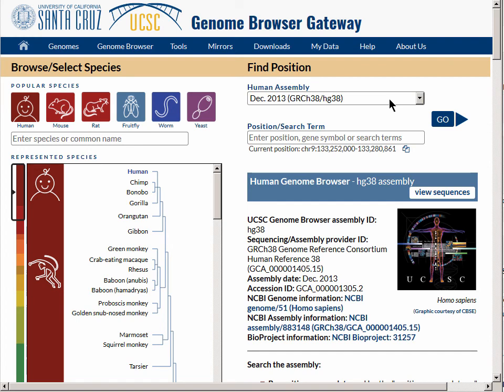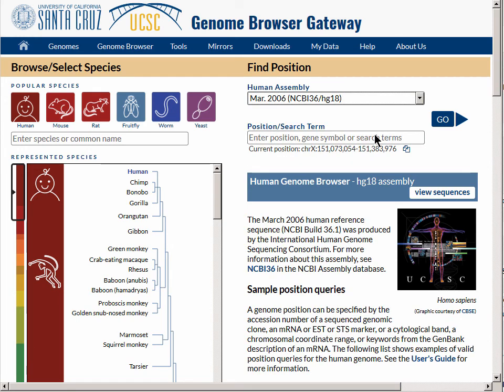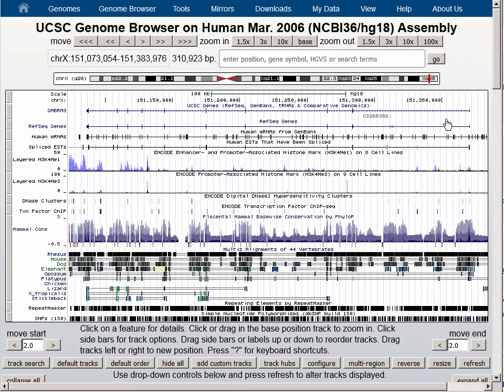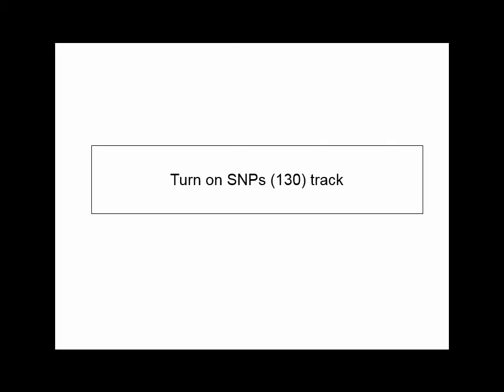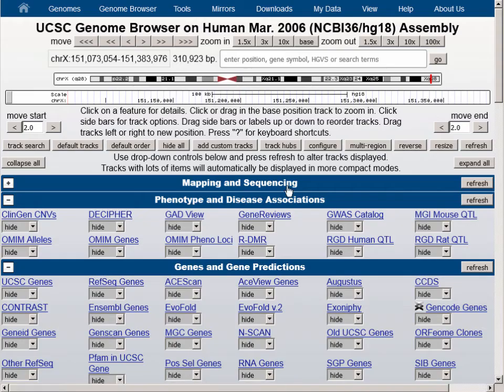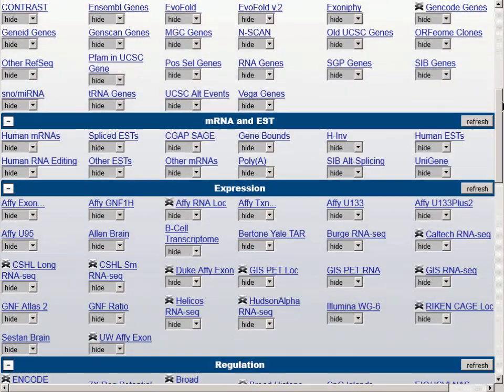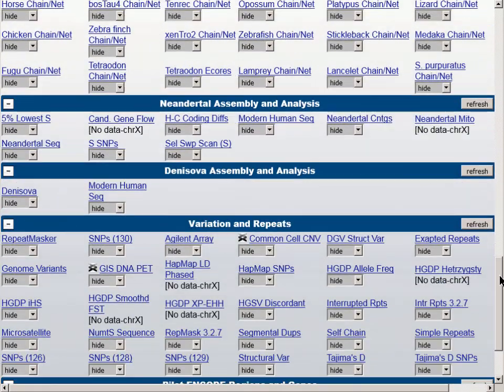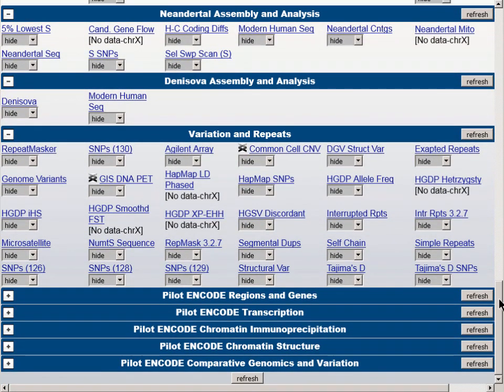To begin, let's go down to HG18, one of the earlier versions of the genome, and we will hit the Go button. At the browser graphic page, we will hit the Hide All button to turn all the data tracks off. Scrolling to the bottom of the screen to the Variation and Repeats blue bar group, we'll draw your attention to the dbSNP track, SNPs version 130.